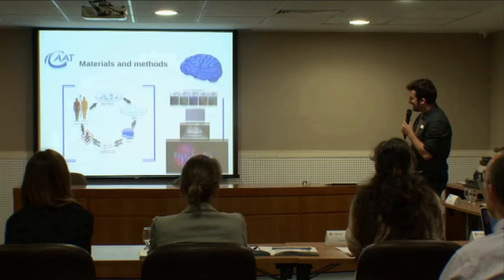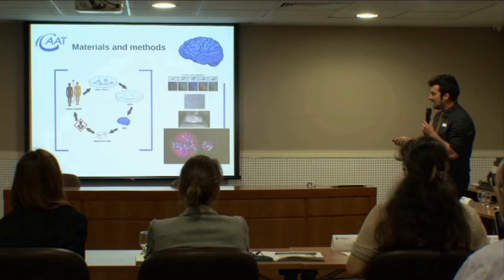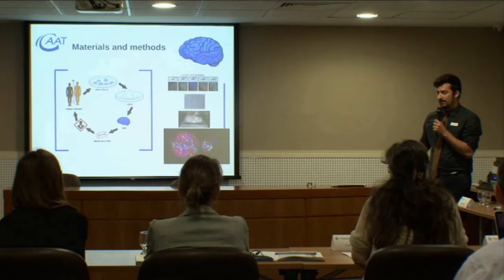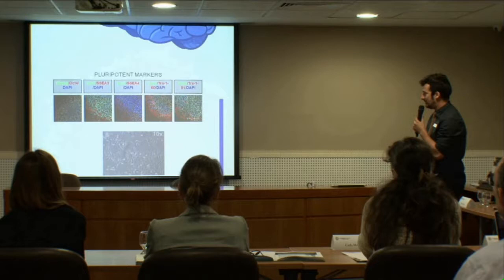What we do is mainly we got fibroblasts from different donors, and then we reprogrammed them to iPSCs. From that point, we try to make a 3D model that we could incorporate in the platforms, in order to predict toxicology, or neurotoxicology in our case. So we make the iPSCs, we make sure that we have really nice pluripotency markers, and then we differentiate neuroprogenitors.